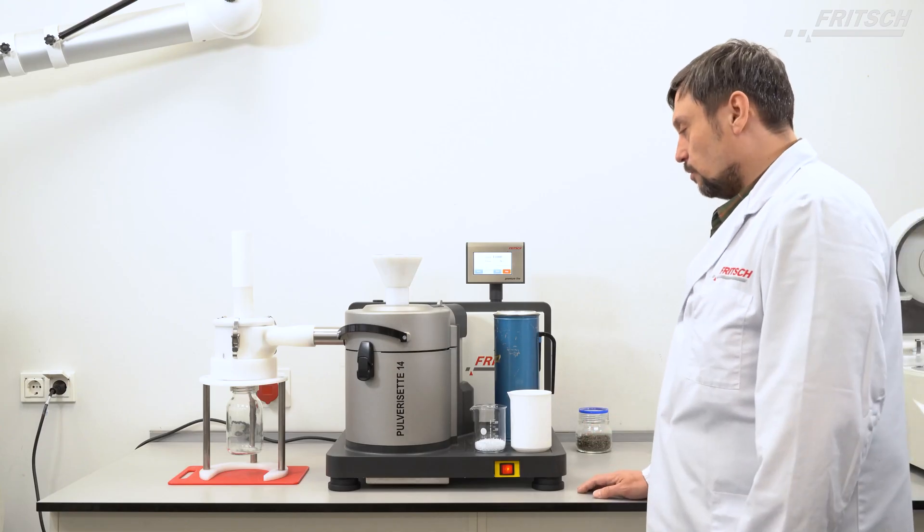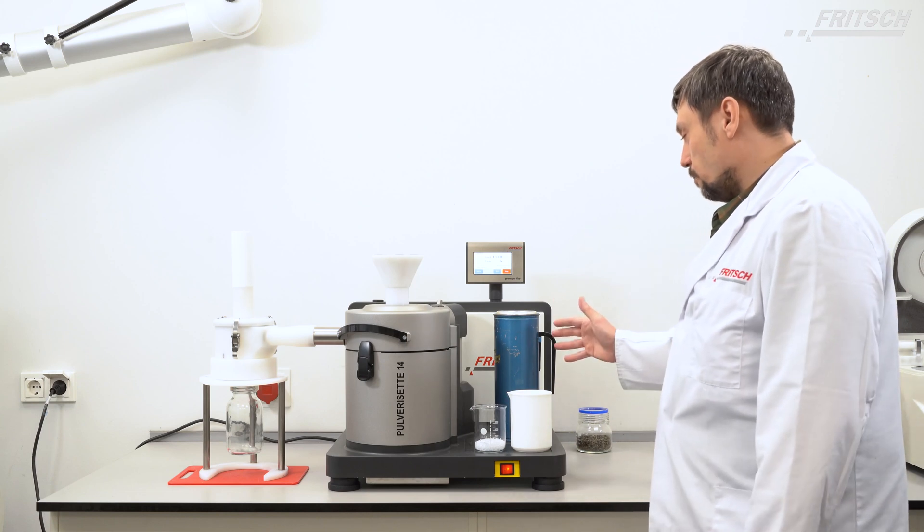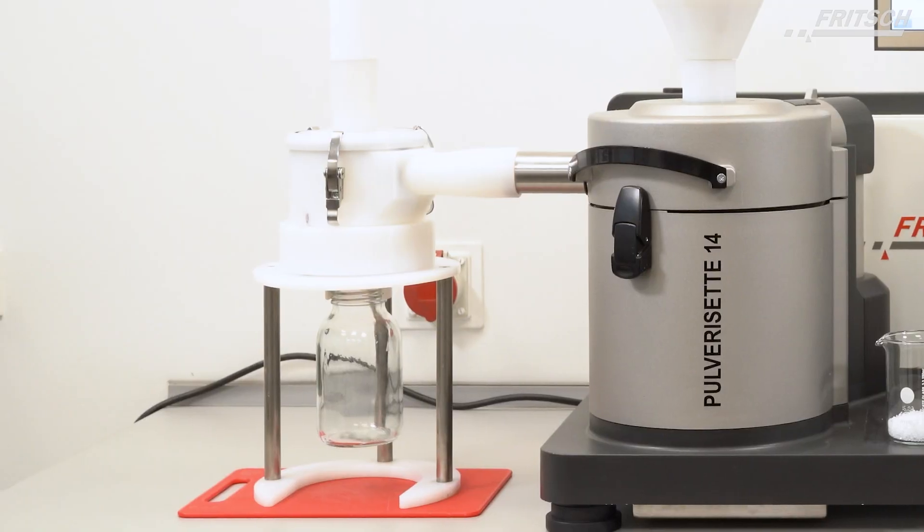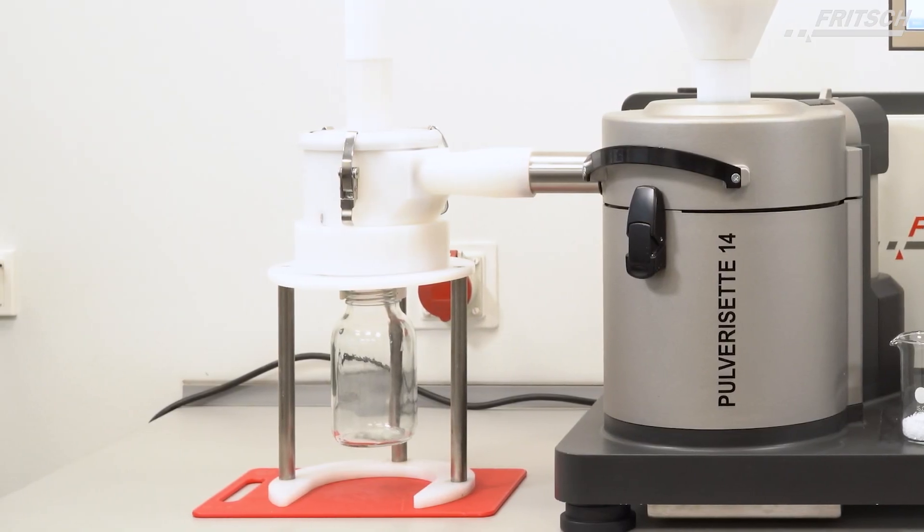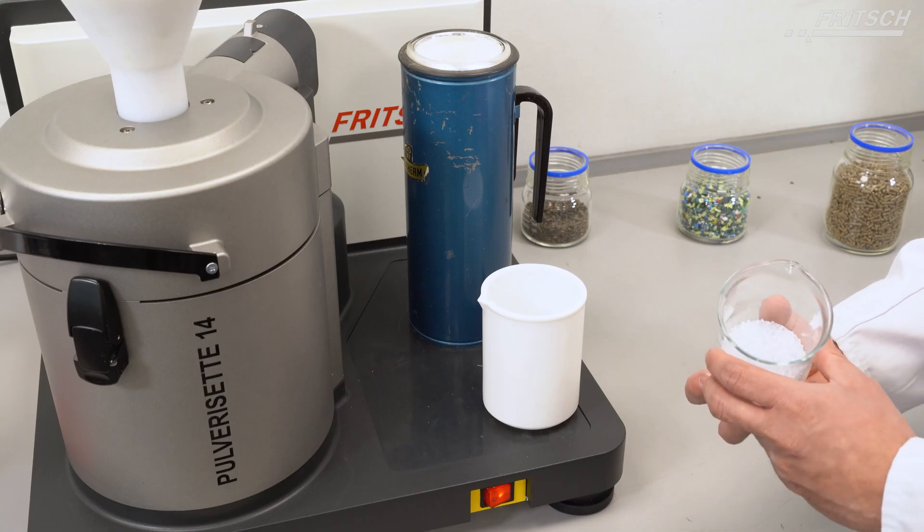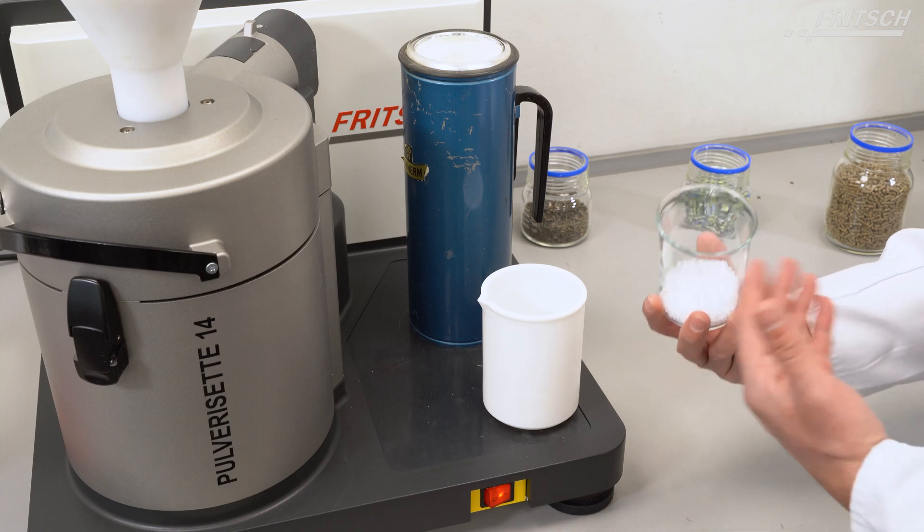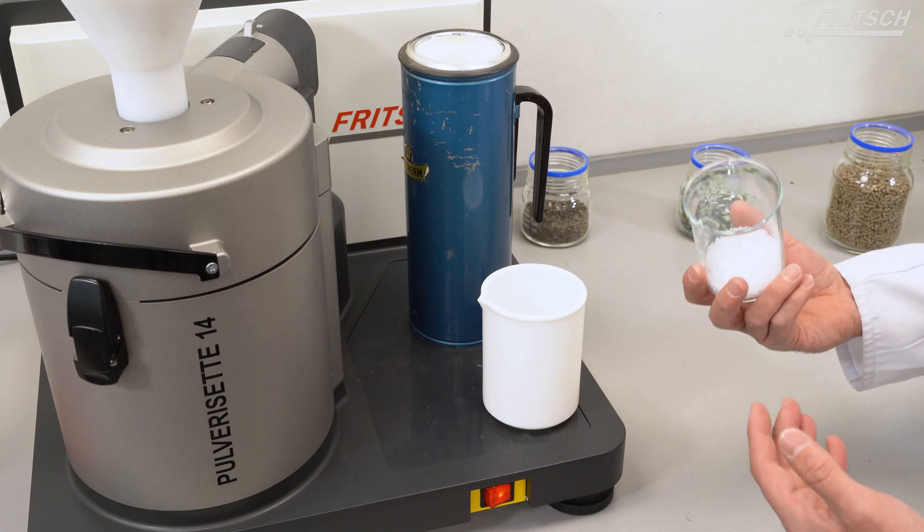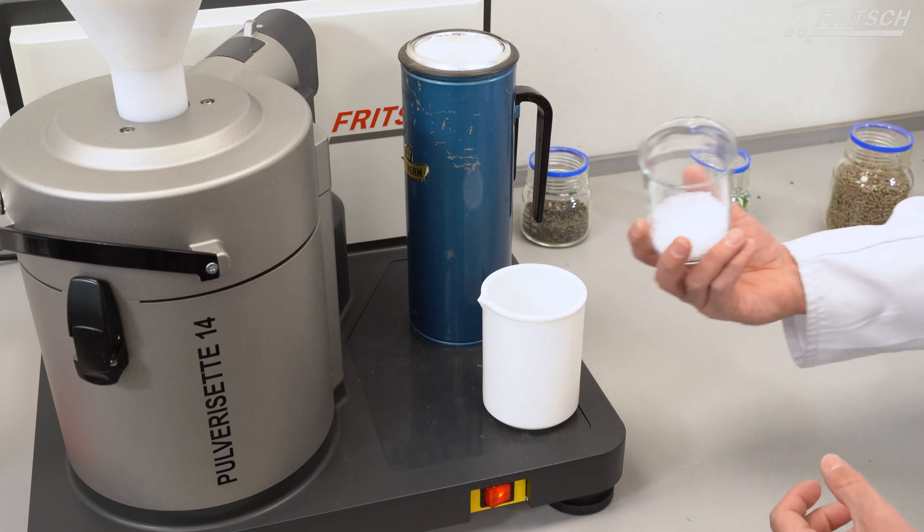We want to grind these polymers with the help of liquid nitrogen and the small volume cyclone separator into micron range. These polymers like to stick or melt when they are ground with high energies, therefore they need to be embrittled.